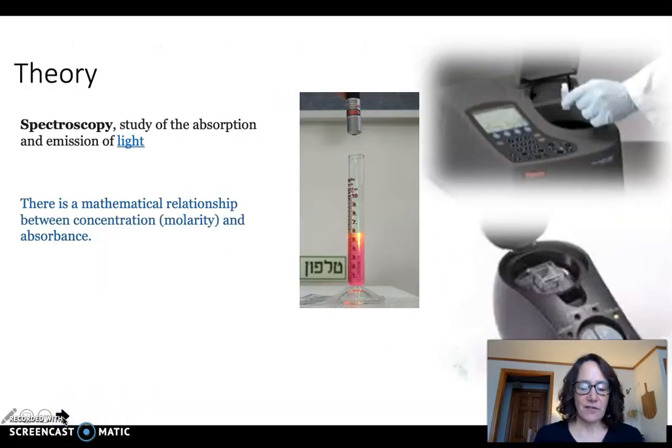This is an area of chemistry that we refer to as analytical chemistry, where I'm actually quantifying what the concentration is. And for example, we use spectrophotometry. This is a spectrophotometer, and you'll use those in AP Chem, and we use them in APES for a couple of experiments.